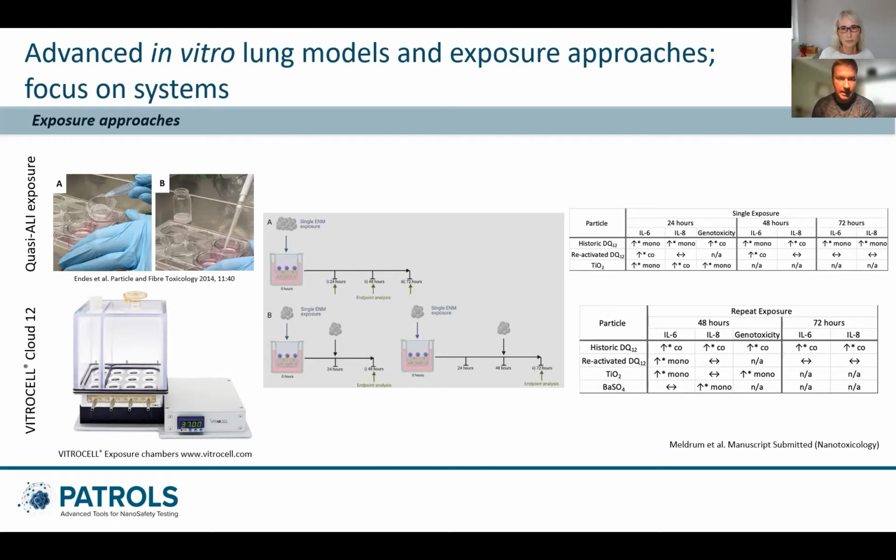So we've done that, but then we also wanted to start to implement the different kinetics of exposure, because commonly a lot of research is just focusing on a specific time point or just a single exposure. And there's a movement now within the literature, as we'll go through in later slides, that highlights that repeated exposures with low concentrations is more realistic towards the real world scenario.